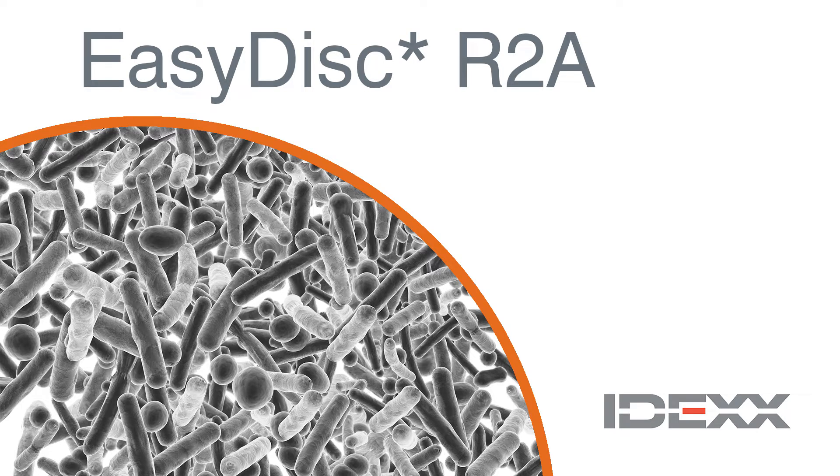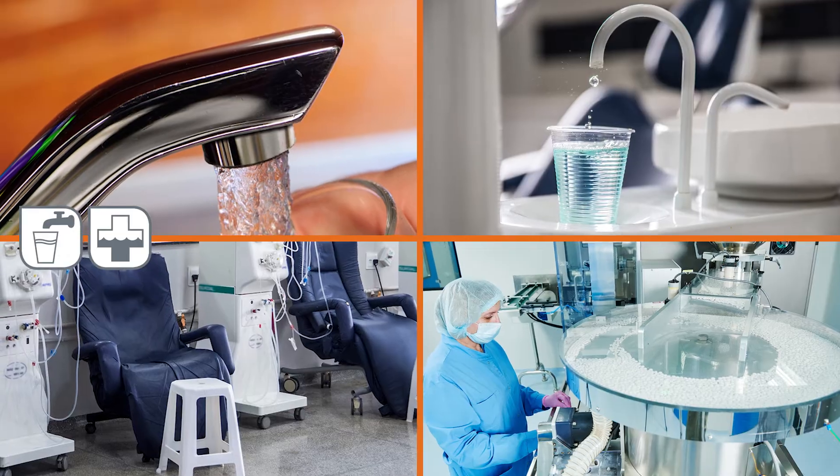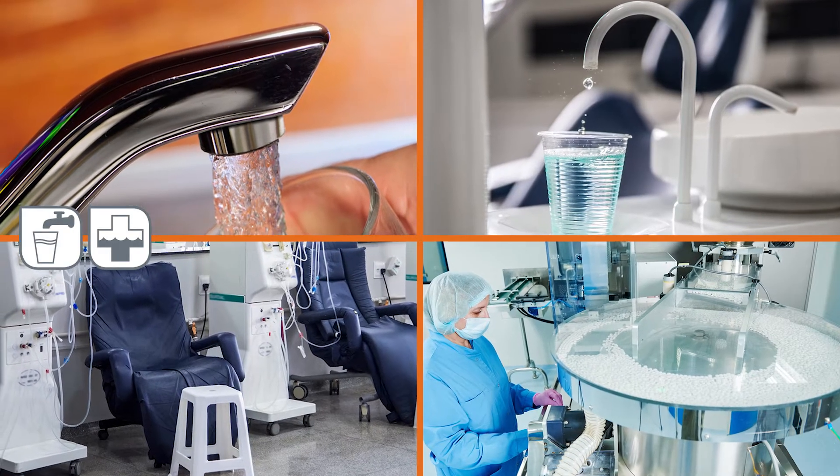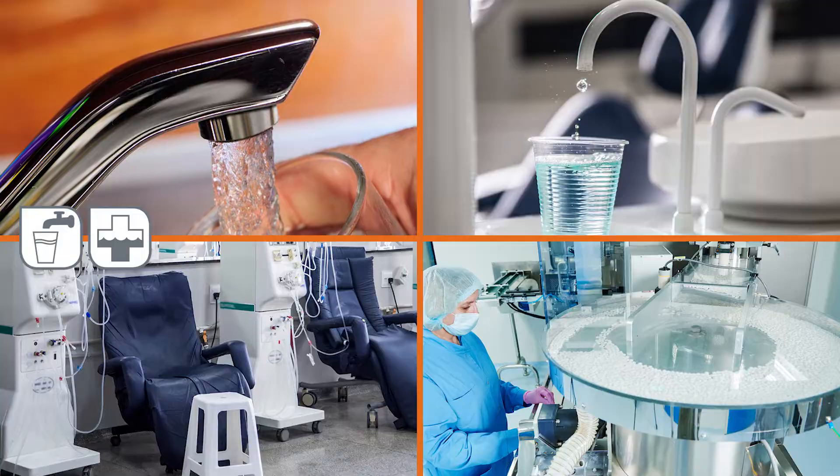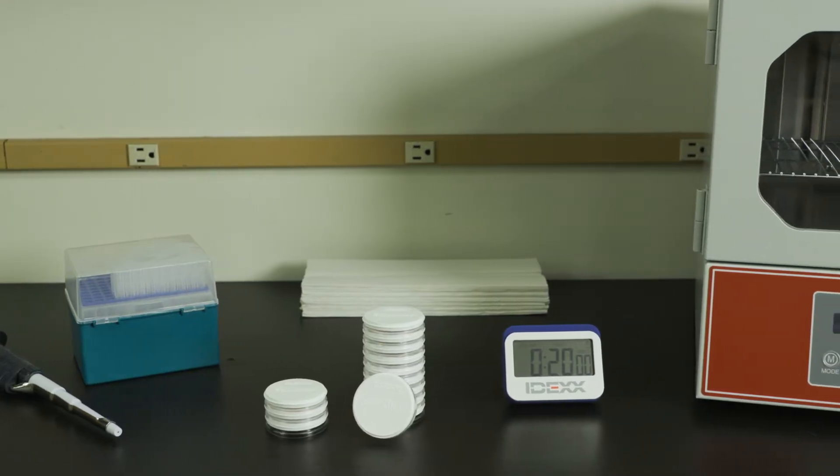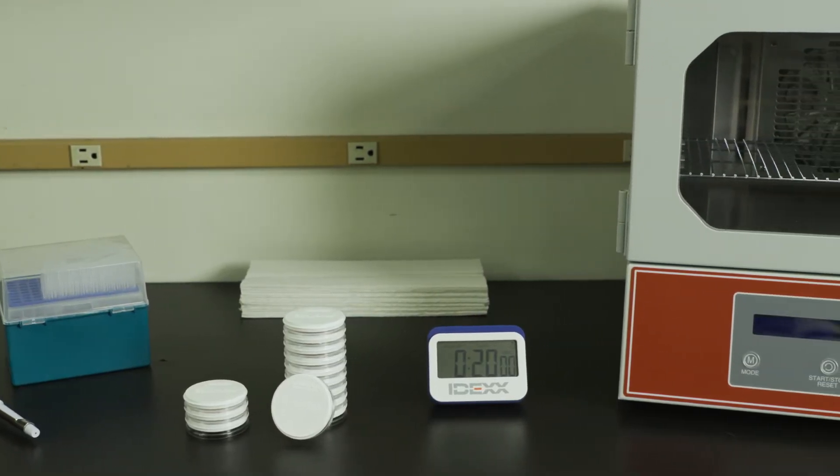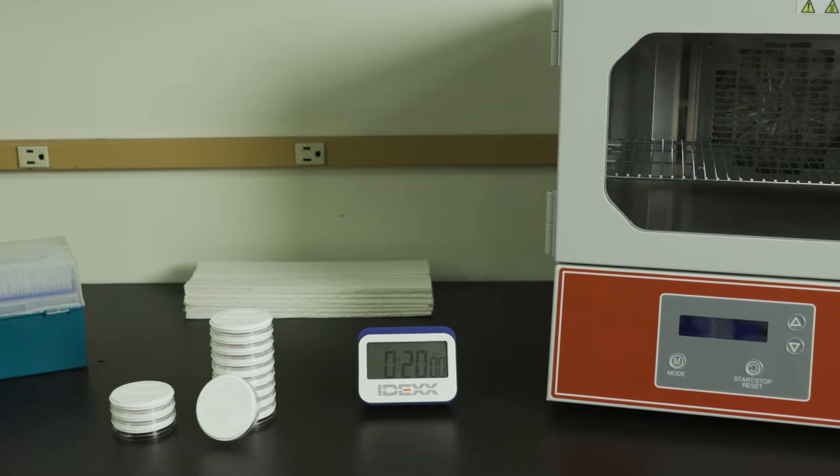The EasyDisc R2A test quantifies total heterotrophic bacteria in water samples in five to seven days with no confirmation steps. In the next few minutes, you will learn how to use the EasyDisc R2A test with a 1 mL water sample.